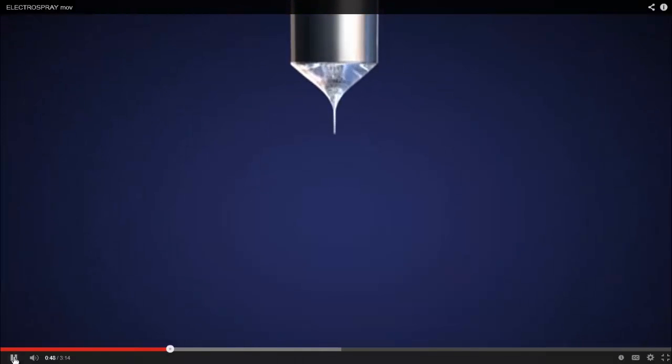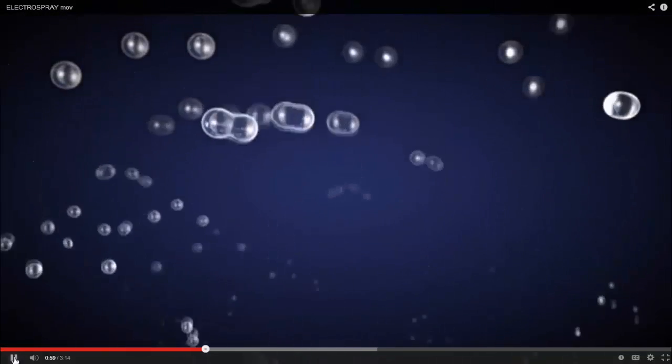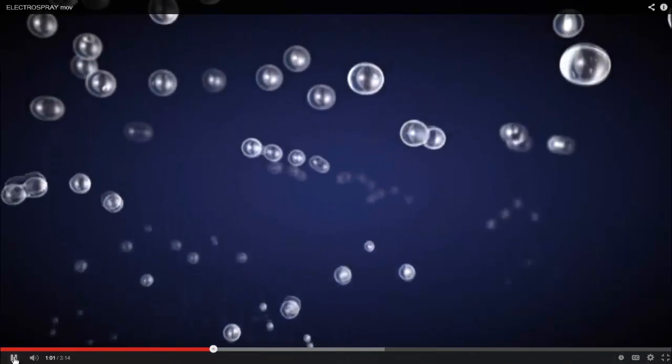Primary micrometric and highly charged droplets are formed in the jet. Due to electrostatic repulsion, they break into finer charged droplets, which themselves break into smaller and smaller ones, thus becoming nanometric.